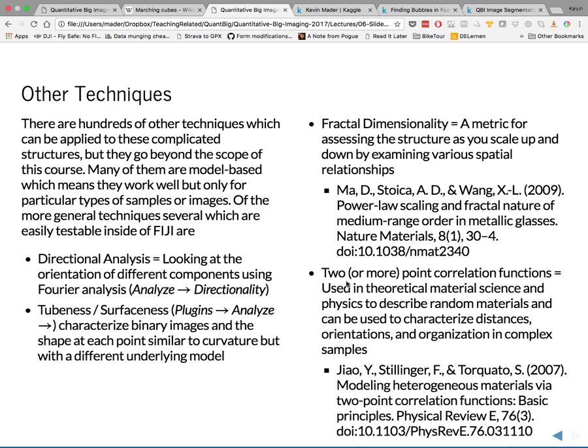the theoretical world. It can also be very useful for looking at a number of different objects and seeing how similar they are, in that rather than comparing all the pixels individually, you can just compare a fairly compact correlation function and see if that has changed or not.